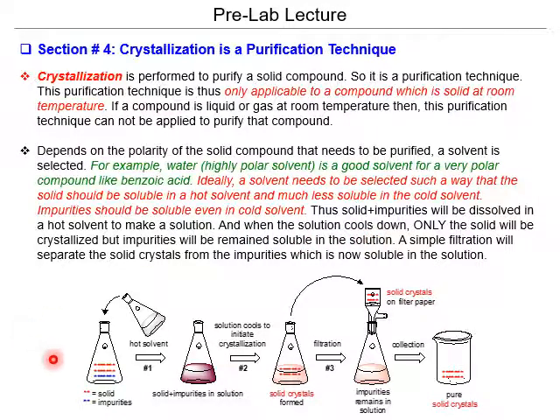But if you are even going to attempt a crystallization, you should know a thing or two about your impurity. So this is why we're doing this, because we know that the impurity is sort of more soluble in the solvent. A simple filtration will separate the solid crystals from the impurities, which are now soluble in solution.